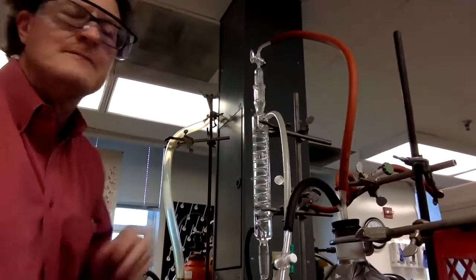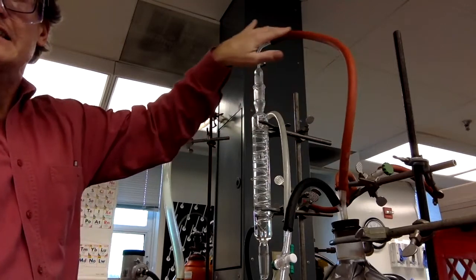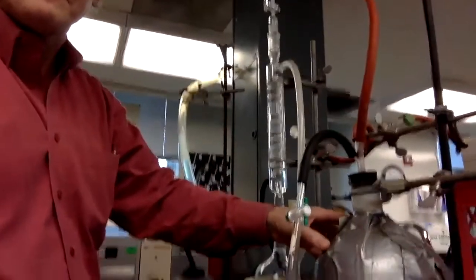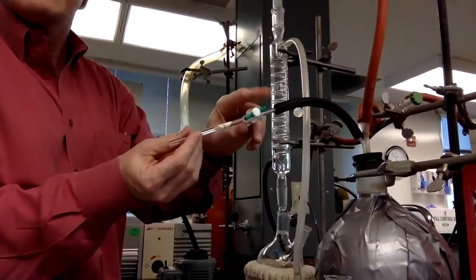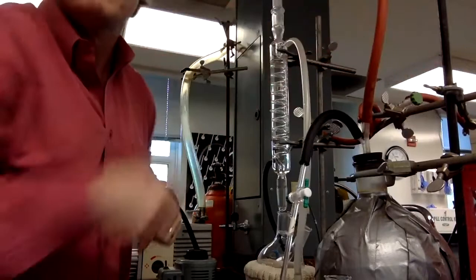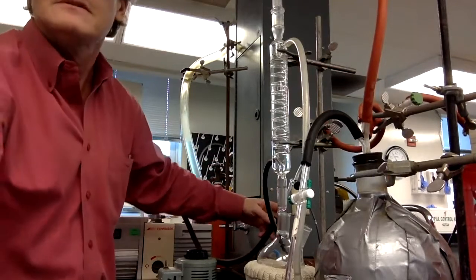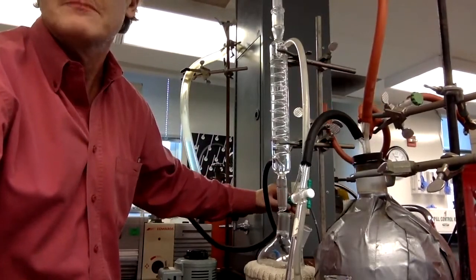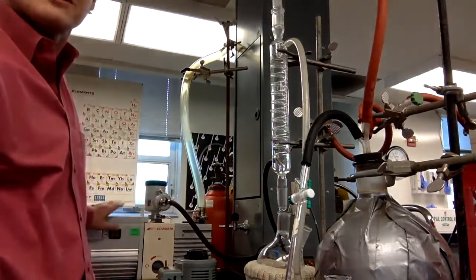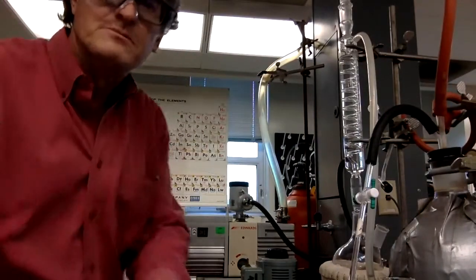But now instead, we have a valve up here so that we can connect this to a ballast jar. We've got a vent valve, another valve here, and then the pressure apparatus going back to the MicroLab box. And over here, we've got another valve, the one with the black top on it. Going over to our pump, we've got a mechanical pump back here. Turn that on, make some noise.